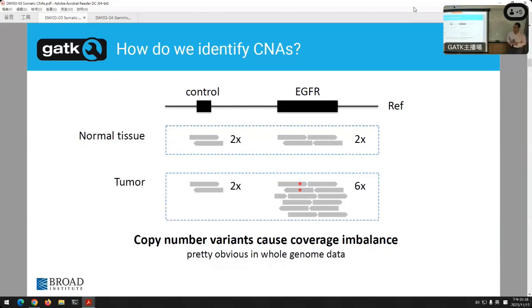So the whole point of this exercise is to find differences in coverage. Now, when Emma talks about structural variation, we'll do more than just looking at coverage. But for the CNVs, for duplications and deletions, we're basically just looking at coverage. It's not exactly true. I'll show you that for the somatic stuff later. But for the most part, we're looking at coverage. Good?